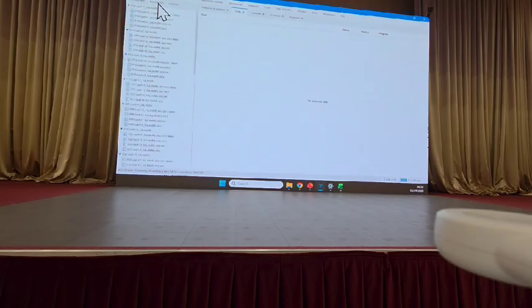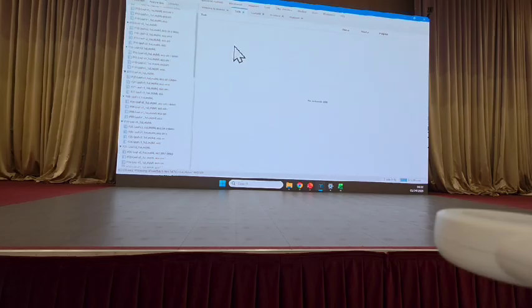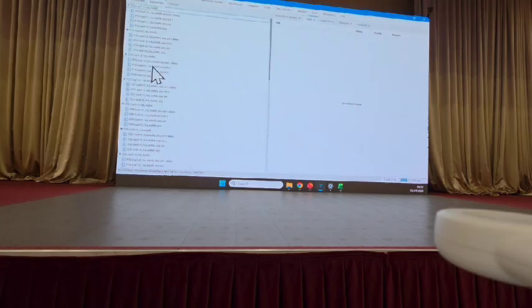So, in the end, you now have your feature lists. And why I said keep, it gives you a better idea of what we just did. For each sample, we built an XIC for every metabolite that we could find.